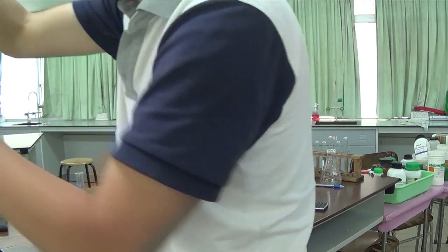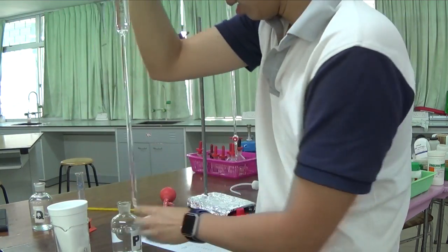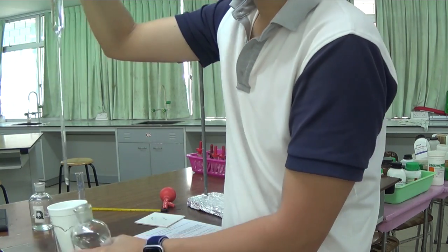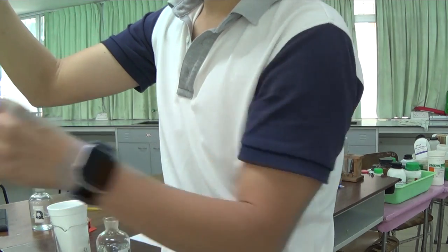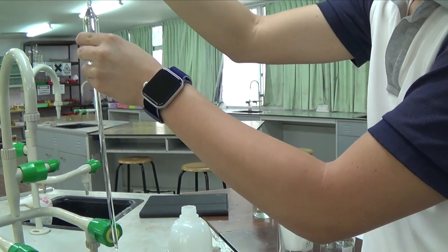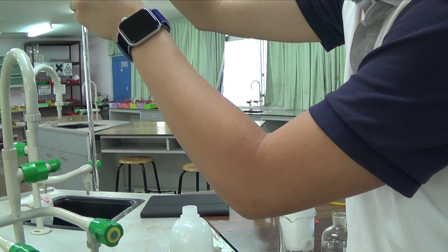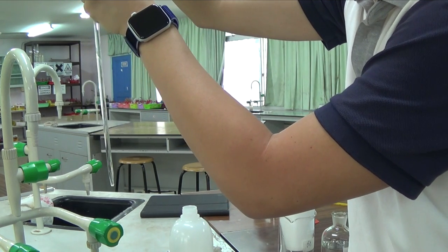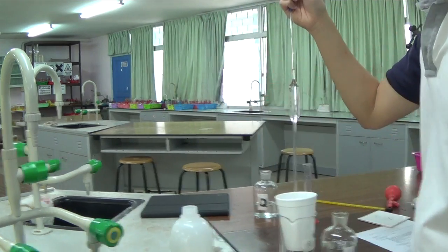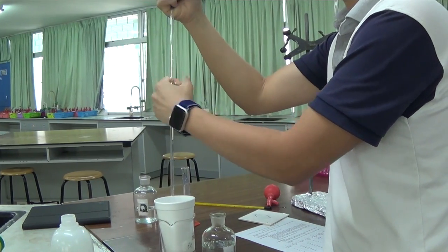I have accidentally ejected a lot more than I need. So I need to suck in more, but I do not eject. Okay, I suck in more, it's okay, but I do not eject back. I do not ever eject back the solution from the pipette into the bottle itself. Okay, so this thing I am ejecting. That's 25.0 cm³.